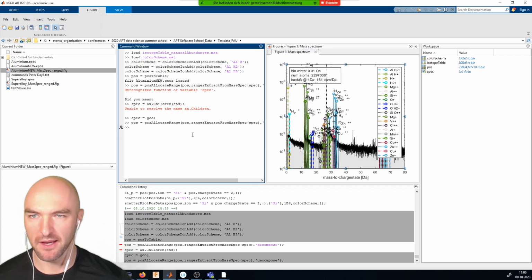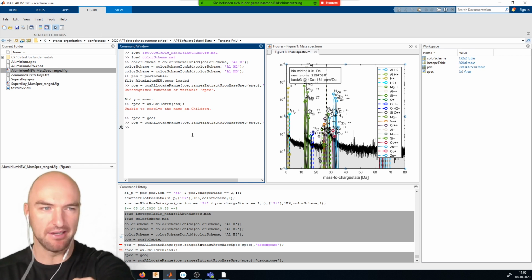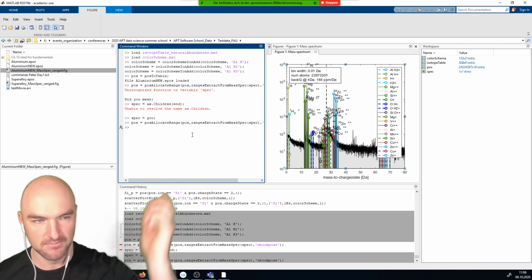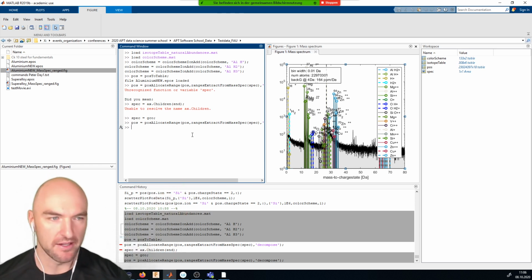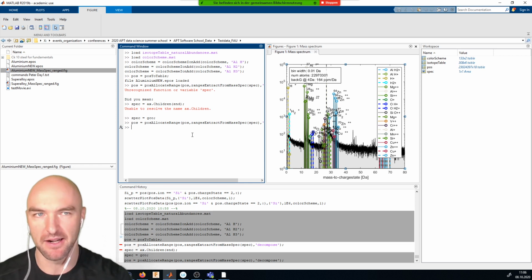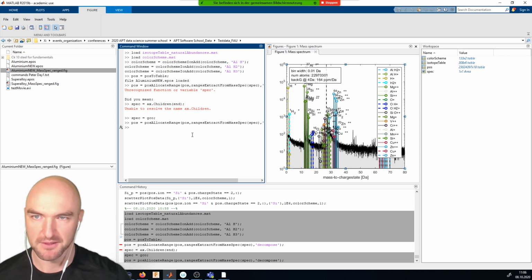And now we will create a plot again, and in this case maybe we want to have a look at one of those nice little needles and do some 1D analysis, some radial analysis, whatever we want to do. Anyway, we will start building up an analysis based on regions of interest. And with that, I'll also explain a little bit of the background of what the objects consist of and what you can do with them.